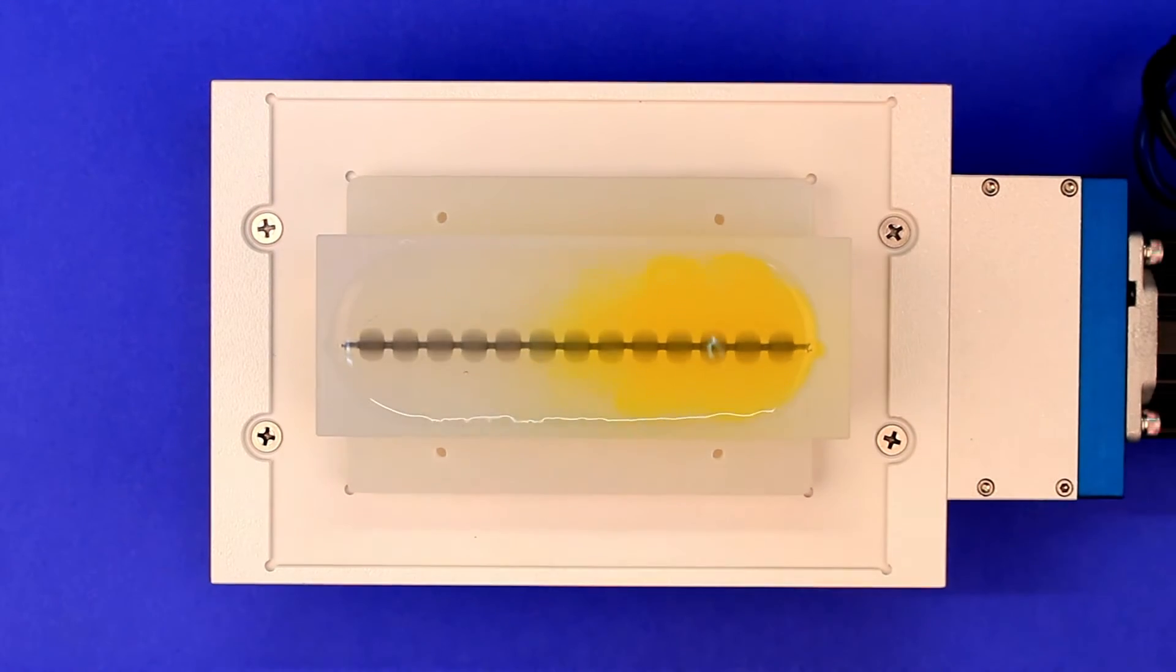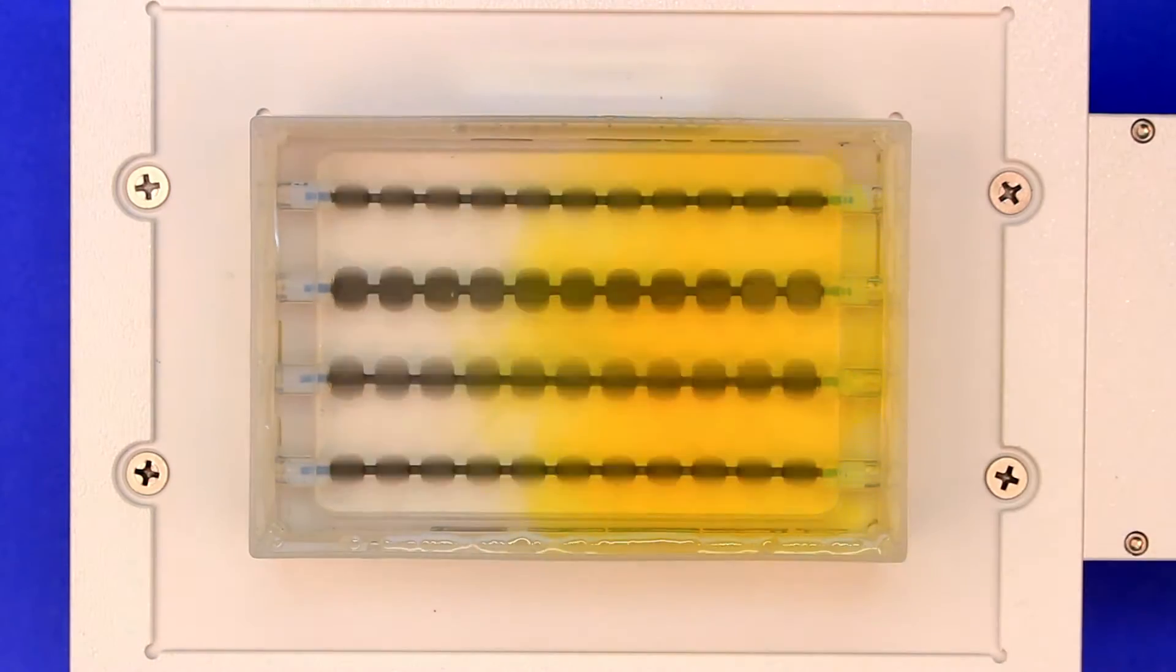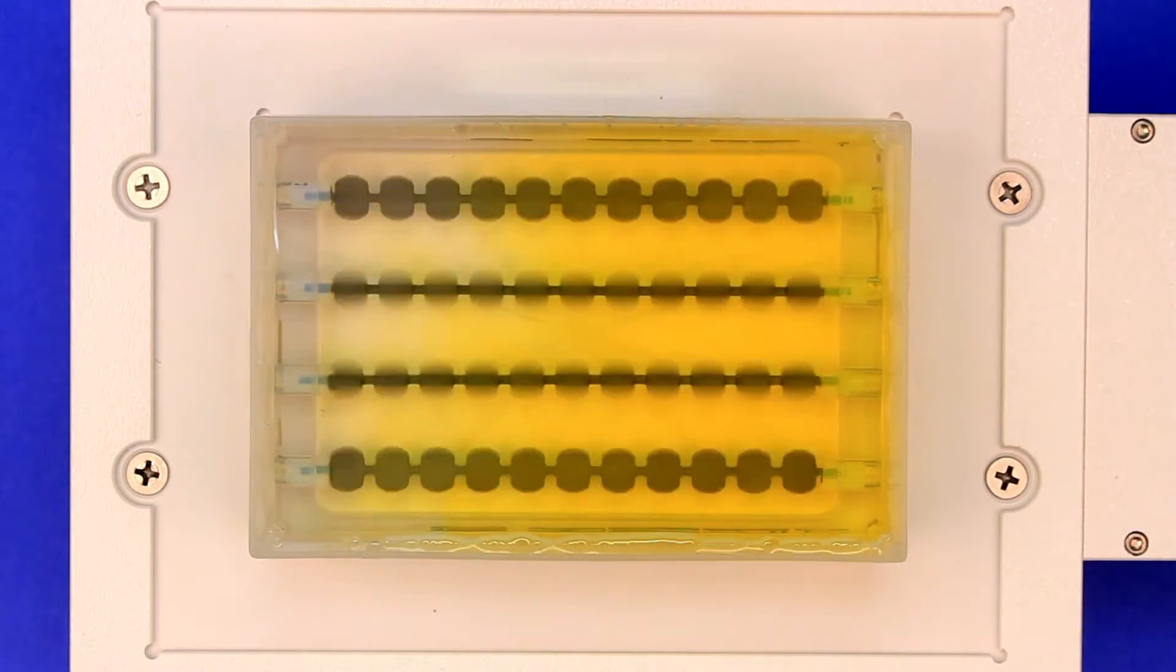Our patented bubble paddle technology allows for reservoirs to be mixed evenly and quickly. You can see the dye gets mixed and dispersed quickly throughout the reservoir.